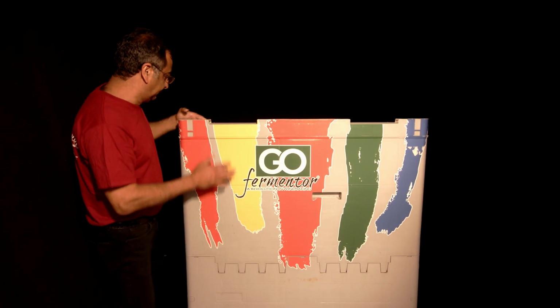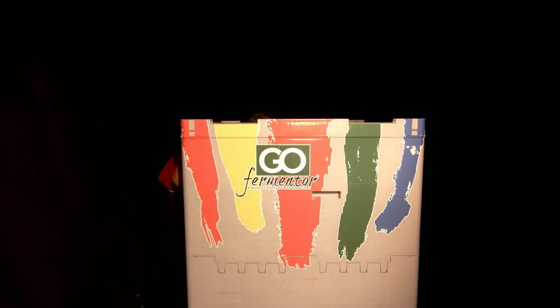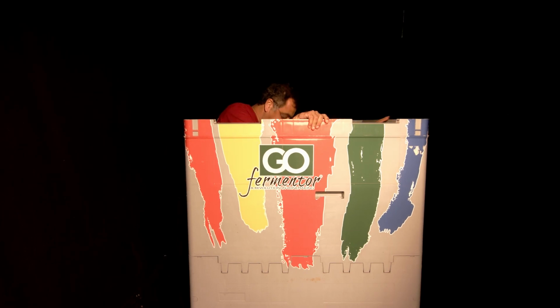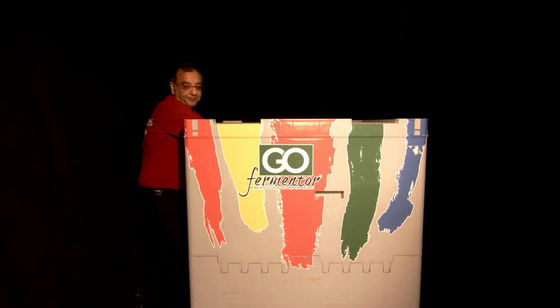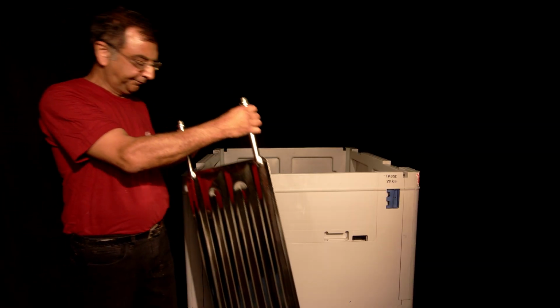Now we're ready to start. Let's open up our base by folding it open. Just pull out the four ends. They will lock into position. We're now going to rotate it so that the front faces us. The front has a little trap door.